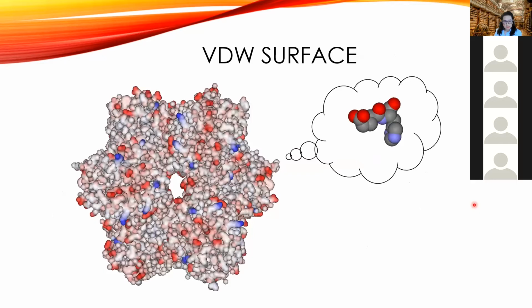So the van der Waals surface, this one has these characters. This one is colored by atom, oxygen in red, carbon in gray, nitrogen in blue. But if you use positive in blue colors, like this one, and then negative charge in red, it will become the color by pKa, for example, which you can relate to charge when you design the molecules to catch with the cleft.